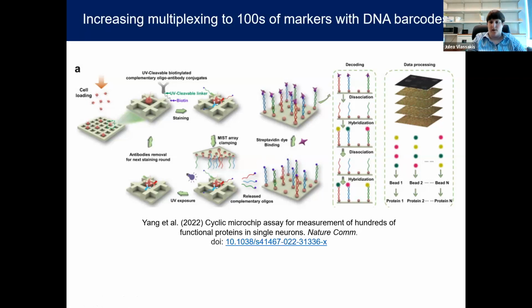And so through a round of like 4 successive binding events with the array and collection of hybrid strands, essentially you can identify, for example, bead 1 based on the binding of the 3 different fluorescent colors over the 4 different hybridization and dissociation steps.